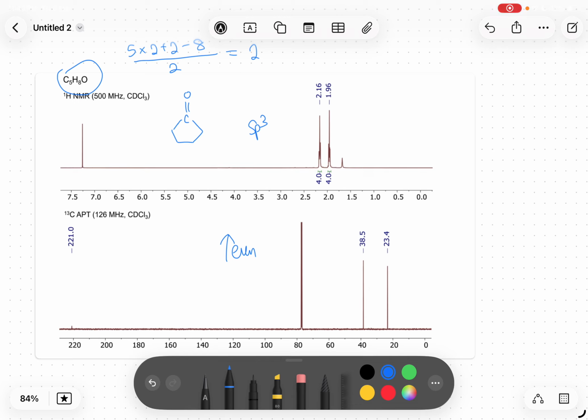The point of these videos is not just to get the right answer. It's more to slowly develop the tools for you to solve more complicated spectra later on independently. These are very simple, but slowly the difficulty will increase, because on the website they have simple, medium, and advanced spectra.